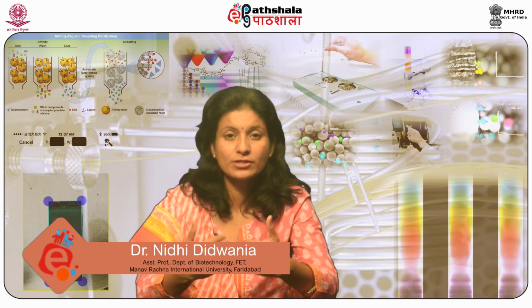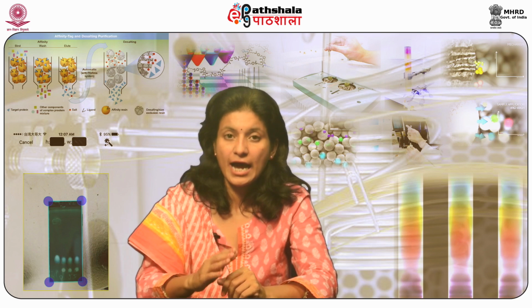Today we are going to discuss the module Ion Exchange Chromatography (IEC) applications from paper chromatographic techniques.